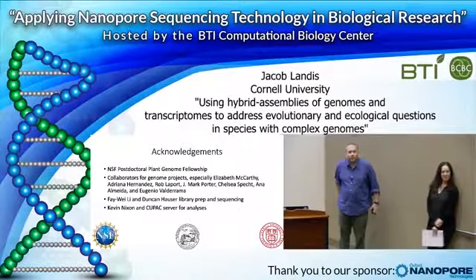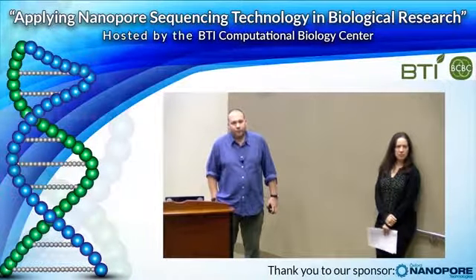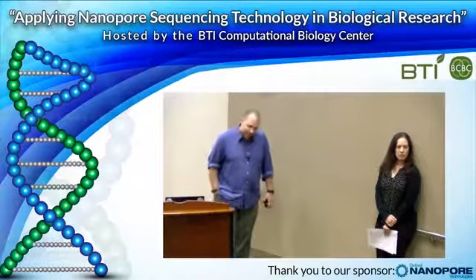Yes. So for the genome assemblies, you were showing separate results from Nanopore and hybrid. I think for the transcriptome, you only showed hybrid and Illumina. Did you also try to assemble those with just Nanopore?